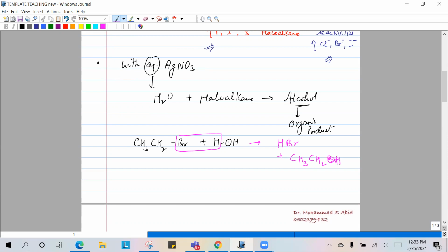This has already been explained in the previous video. You are starting with bromoethane, and you will end up with ethanol.